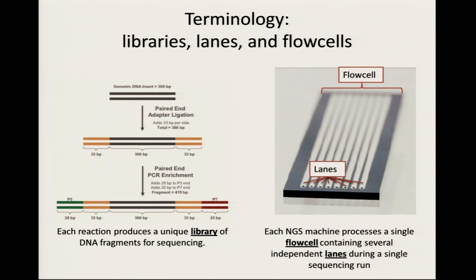So for example, this has happened in a project at another center, I won't name names. You have this flow cell, and for whatever reason, something stopped in the reaction, right? Later, the machine operator resumed that reaction, and now every read that came from that flow cell misincorporated a base at the same cycle. Like cycle 15 has another base misincorporated, right? And every single read that came from just that one flow cell has that error. So modeling those flow cell specific errors is very important, right?